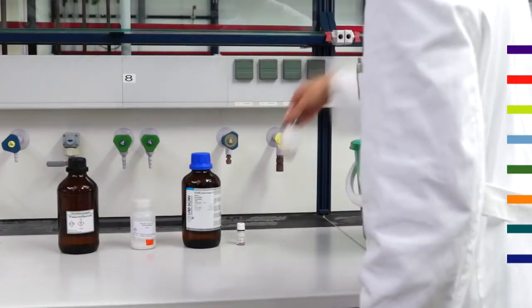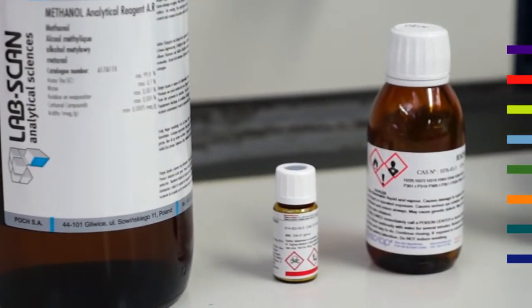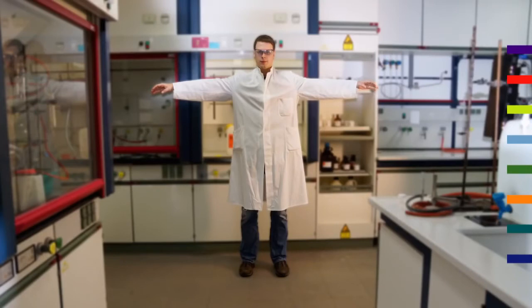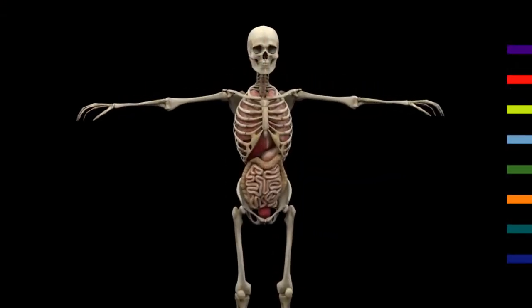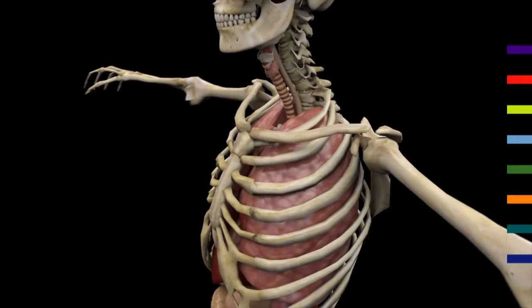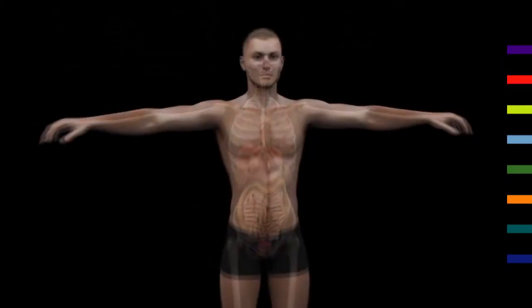Poisoning can cause several different effects on the body. Symptoms may occur suddenly, acute poisoning, or gradually, chronic poisoning. Chemical compounds may be resorbed in different ways. For example, inhaling via the lungs, that is, gases, aerosols, and in general, respiratory poisons, orally via the digestive system, or dermally via the skin and mucosa.